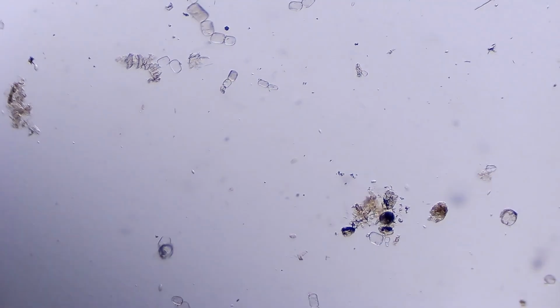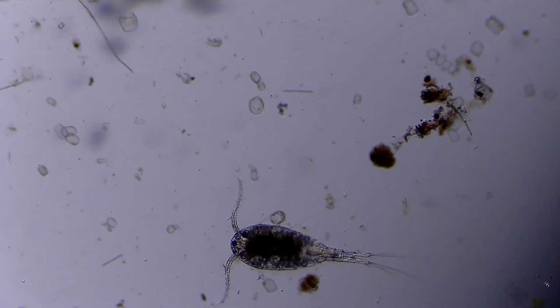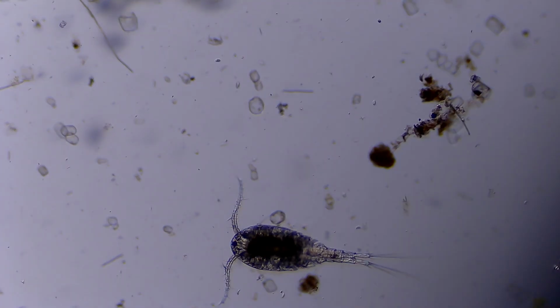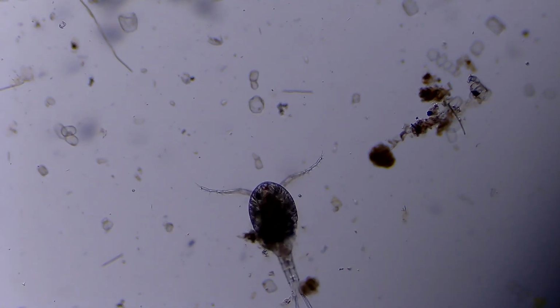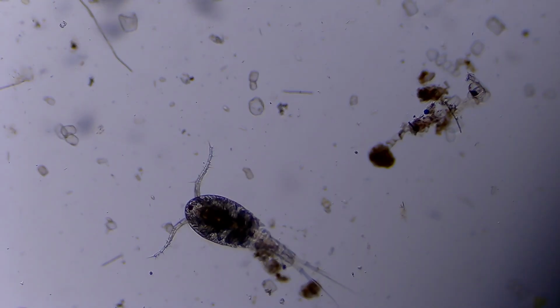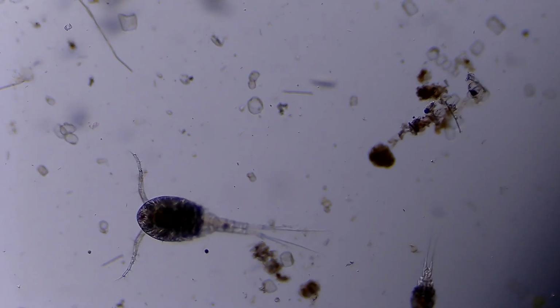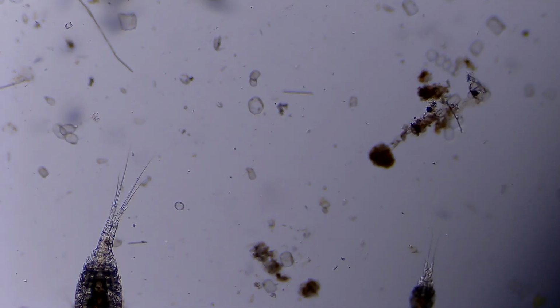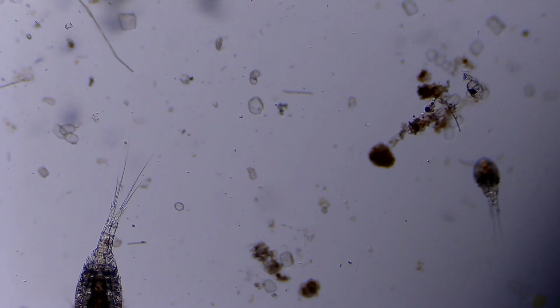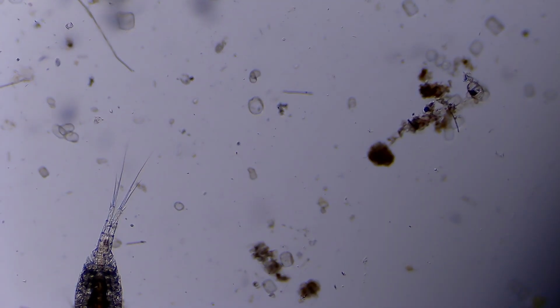Now, I did want to get the top view as well, and I'll see if I can get it in focus here. And this guy, he's really active. He's really fast. You can see, I guess it's breathing inside, and you can kind of see him eat things too. Later on, I'm gonna feed him some spirulina powder, and it's incredible watching these guys eat. But super cool to see what's in our water. There's all kinds of stuff in here, guys.